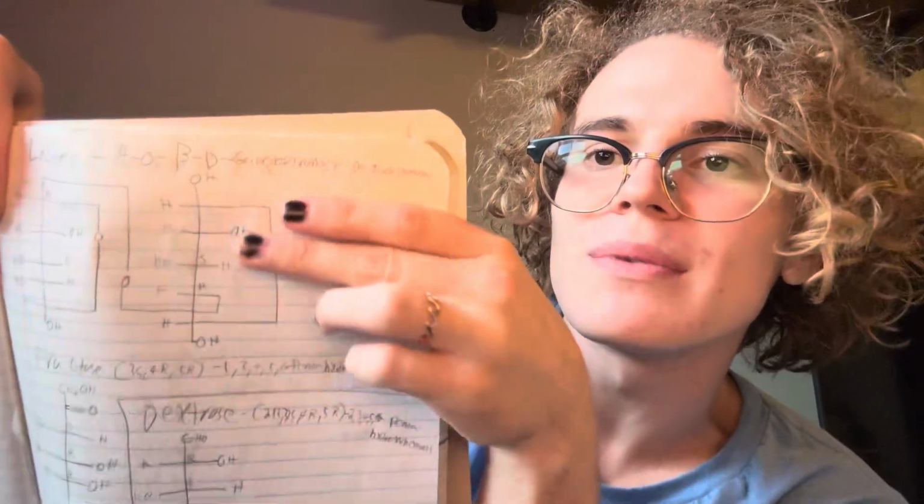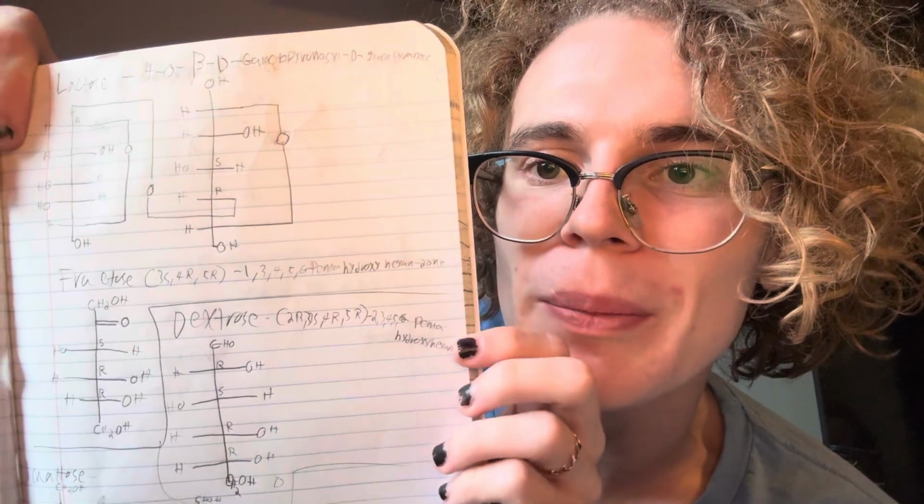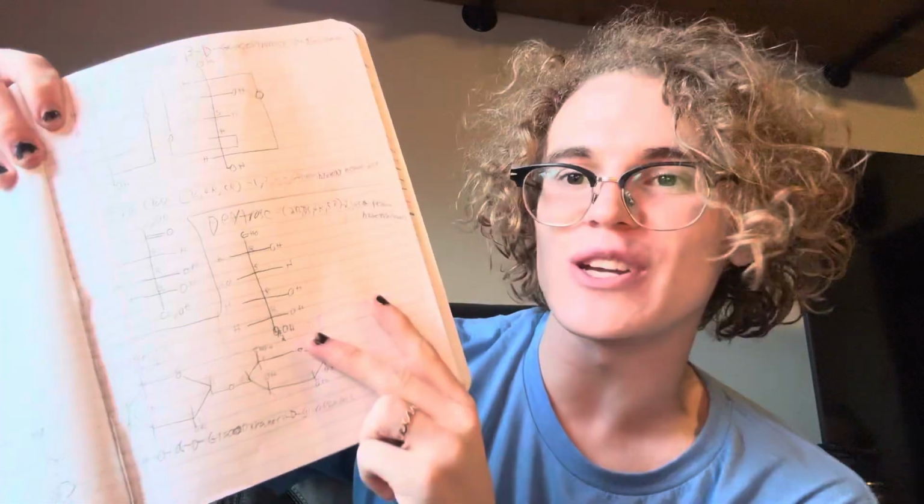Well, here, hold on. Lactose would be, I've got the IUPAC names here. I certainly hope you can read that. I'm not going to read this out right now. That's a lot. So yeah, we've got dextrose here.